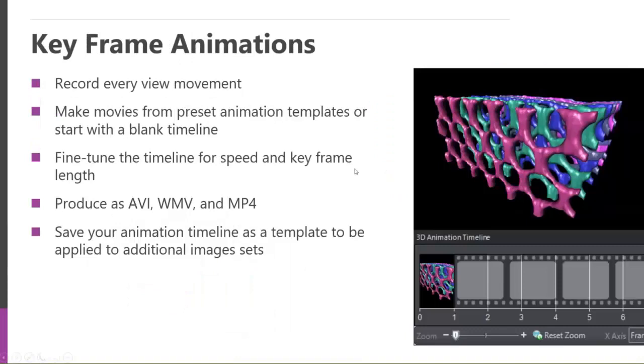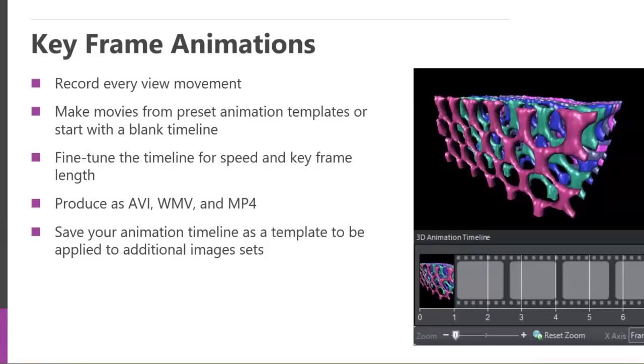As far as animation, it's pretty simple to create these. You basically just display the view that you want to see, and you click a button, and it records that current position. And then as you record more and more positions, and then play that back, the software will interpret, interpolate the various views and insert frames there also. When you publish them, you can create these AVIs, Windows movie file formats, or things like MP4s, which is very common movie format.